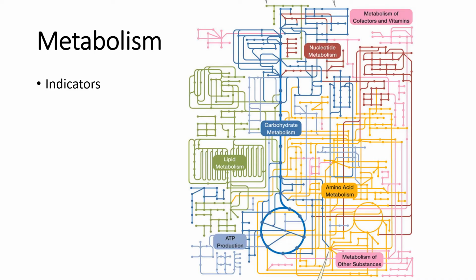To definitively identify the bacteria, you need to generate a biochemical profile or an enzyme profile. So you need to determine which enzymes the bacteria has and what types of biochemical reactions it can facilitate. And of course, because we can't see those enzymes or the products of the reactions, we need to use indicators, which indicate that a reaction went forward. In previous labs, we have looked at carbohydrate metabolism and also nitrogen metabolism, which involves proteins and amino acids. In this lab, we are going to look at miscellaneous reactions, so they don't fall into a particular group.